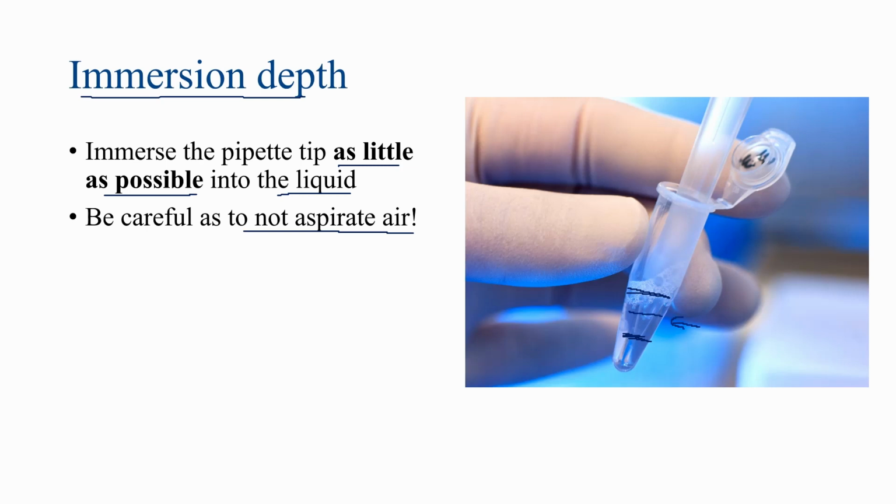And you want to ensure, of course, that you don't immerse the pipette so little into the liquid that you end up, for example, having the pipette tip here and withdrawing air in the process. The risk of withdrawing larger amounts of air increases when you're dealing with larger tips with larger pipette volumes that you have your pipette set on to take up. So just keep in mind that you want to immerse the pipette as little as possible into the liquid, but also ensure not to aspirate air. This particular advice comes from the pipette manufacturer Eppendorf.